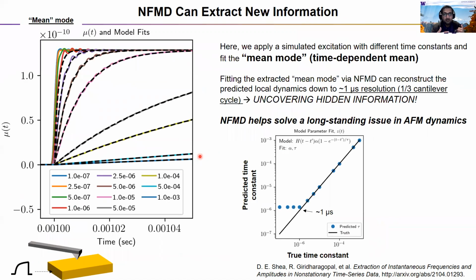The other thing that I pointed out, the limitation of current techniques, is that when we're feeding in something, we want to see single exponential kinetics or some sort of reasonable kinetics, and we get these kind of dips in this relaxation back in instantaneous frequency. That's just the nature of what happens to a cantilever if you solve the differential equation for how a cantilever responds to a time-dependent change in its resonance frequency. That's just going to happen. So how do we get that out?